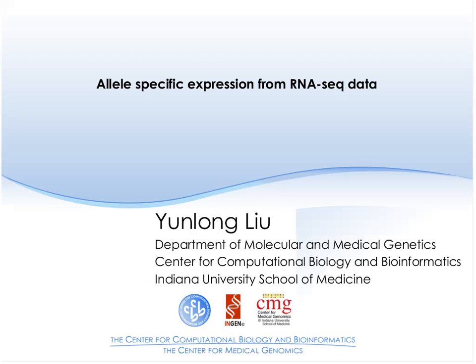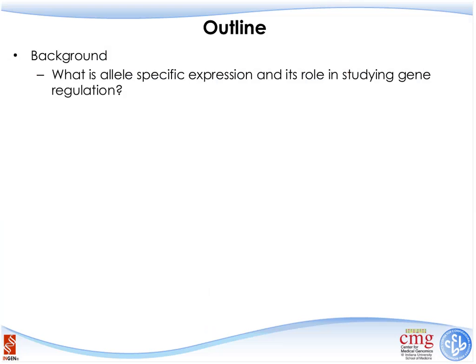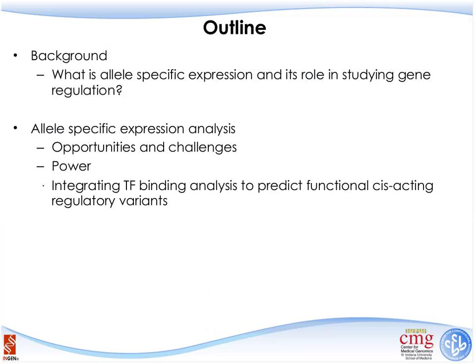And thank you very much to Dr. Dewey for the wonderful introduction of the RNA sequencing experiment. So I'm going to switch gears a little bit, talking about allele-specific expression studies from RNA sequencing data. I will first briefly introduce what allele-specific expression is and its role in studying gene regulation. And I will go ahead to talk about opportunities and challenges using RNA sequencing technology, and mention a little bit about the power identification, and also towards the end briefly introduce integrating transcription factor binding analysis to predict functional cis-acting regulatory variants.